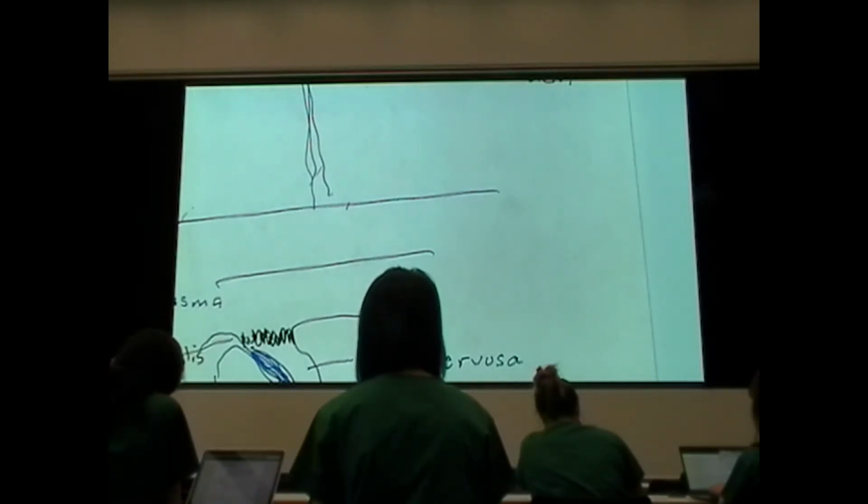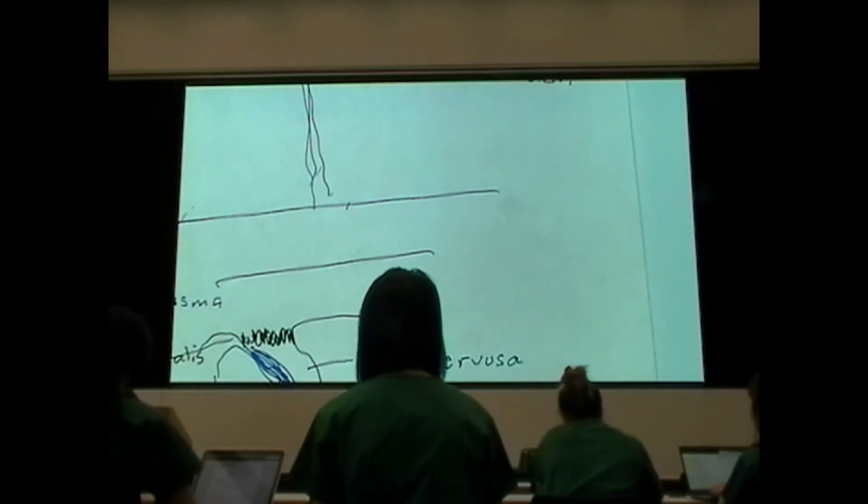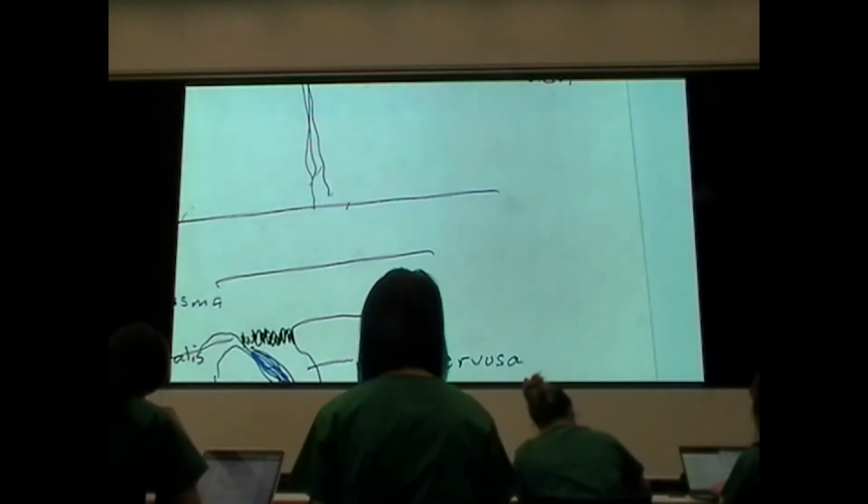Now, as I told you, that part of the pituitary is basically a downgrowth of the hypothalamus. And if one examines it in a light microscope, you see that it consists entirely of axons. And cell bodies are back up in the hypothalamus.